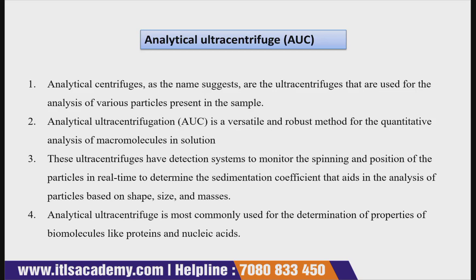So whenever you want to determine the properties of proteins and nucleic acid, which type of centrifuge is used? Analytical ultracentrifuge is used. You should always remember one thing: the analytical centrifuge monitors the spinning, as well as the position of the particles in real time, right?